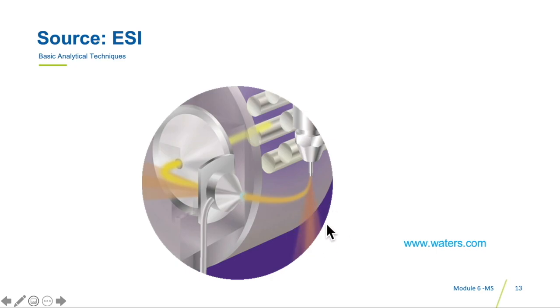The yellow stream represents the droplets that become small enough through the drying process called desolvation, aided by the nitrogen gas flow and the high temperature, to be attracted by the vacuum coming from the cone located in the middle of the diagram.